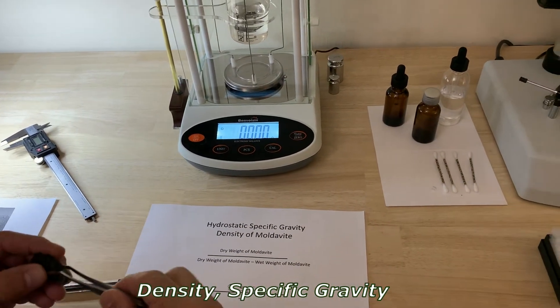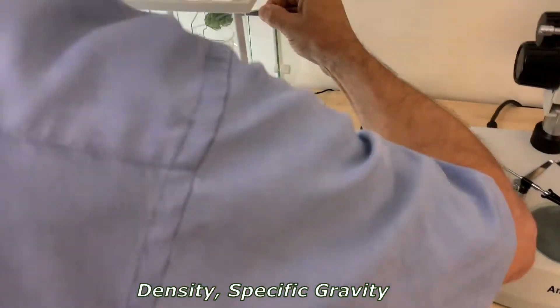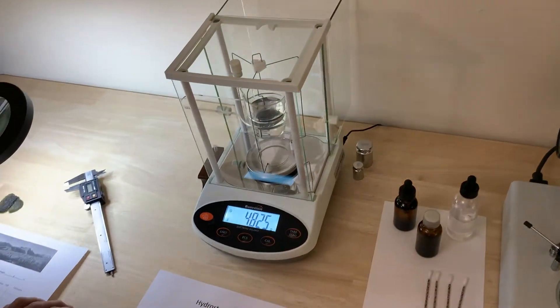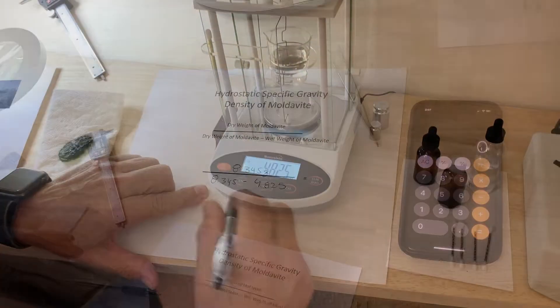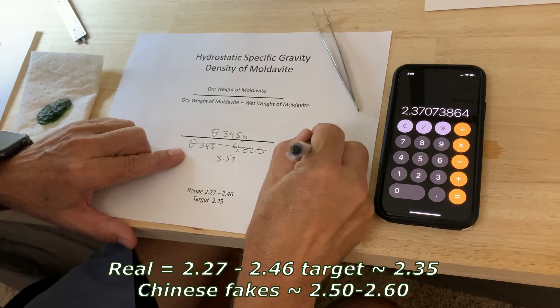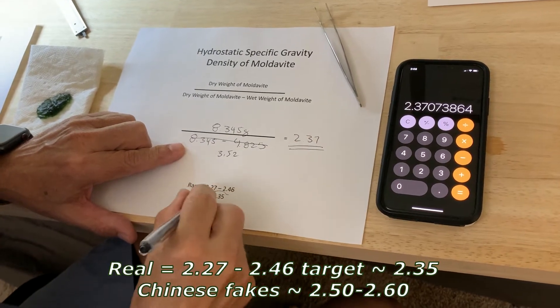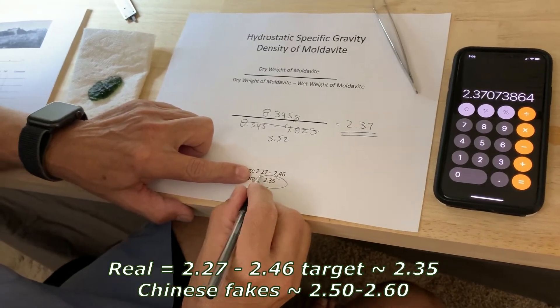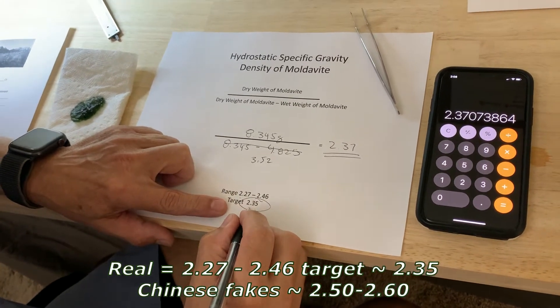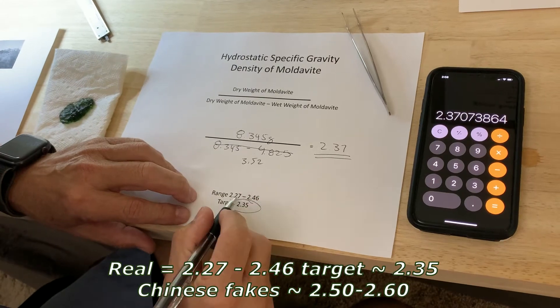Next we weigh the sample in distilled water. There's some air bubbles on there that makes it a little less accurate. We're going to come up with 2.37—look at that, it's right next to our target. The range is 2.27 to 2.46, and the target's about 2.35, but it can be anywhere in this range.